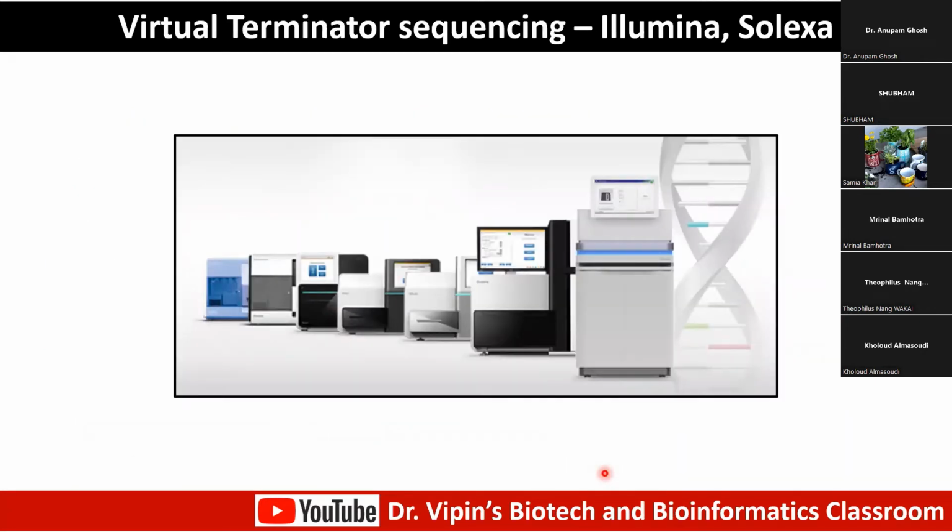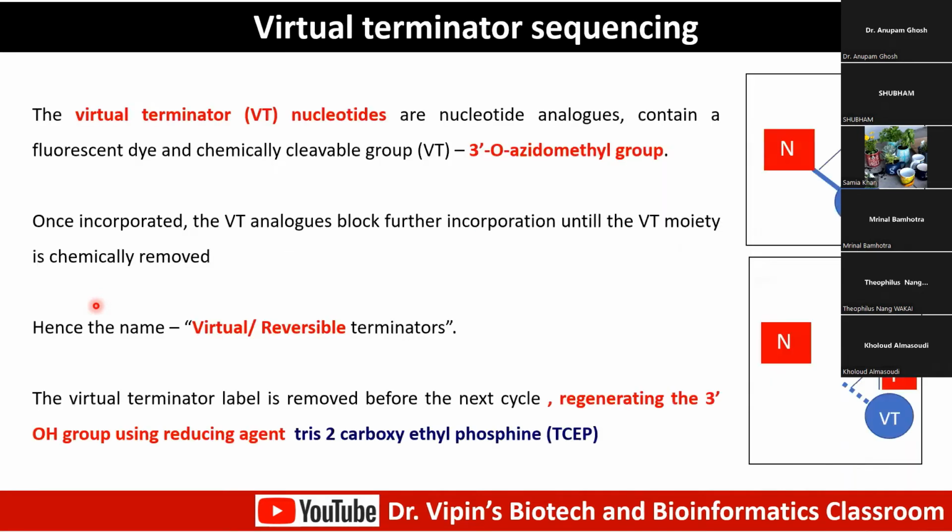So first we talk of Illumina, or the basic sequencing reaction that takes place in Illumina. Illumina has a whole range of sequencers, so this is basically your revolution, where depending on your requirement, you have various types of Illumina sequencers giving you a certain range of high throughput. So this has also democratized the sequencing revolution. Earlier, sequencing used to be restricted to a few centers, and you had to send your samples. Now, individual labs can have sequencers of their choice based on their requirements. So this is also democratization of the sequencing reactions that were initially not possible. So that's the revolution.